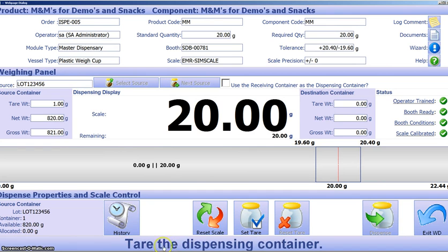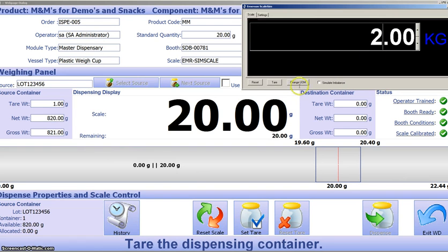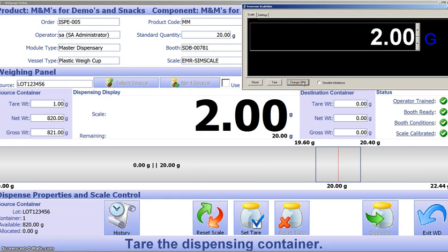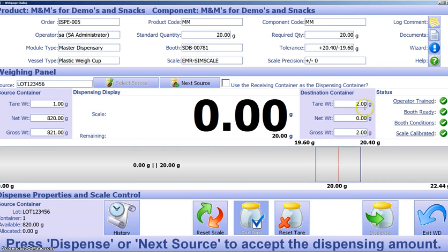Now, following our instructions down at the bottom, it says to tare the dispense container. We're, for our demo, just going to use this little simulator. So let's say that our dispense container was two grams, not two kilograms, we'll change that to two grams. Once we have that ready, we'll set the tare. We now see that the scale resets to zero and our tare weight is two.